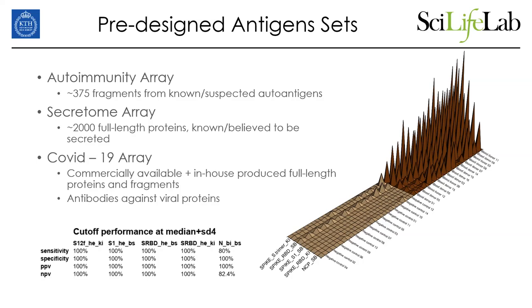We have also recently produced a secretome array, which has about 2,000 full-length proteins that are known or believed to be secreted. These have not yet been offered to external users. We were hoping to be able to do that this spring, but it seems to be something maybe for the autumn or winter.